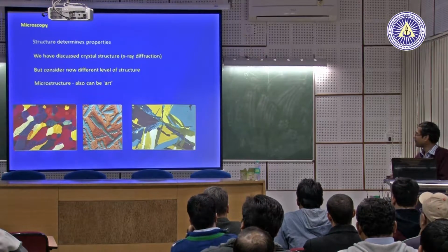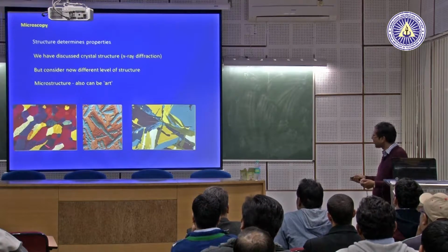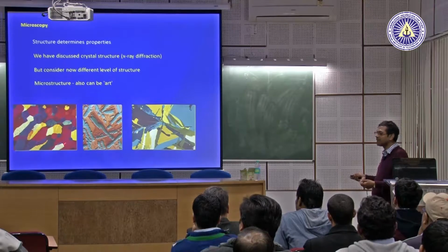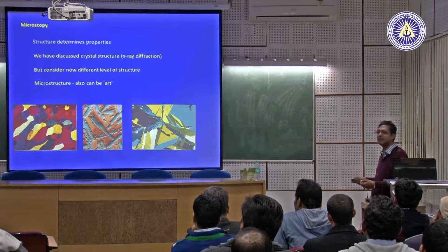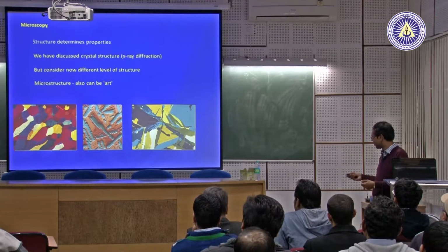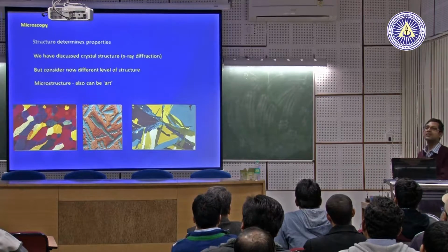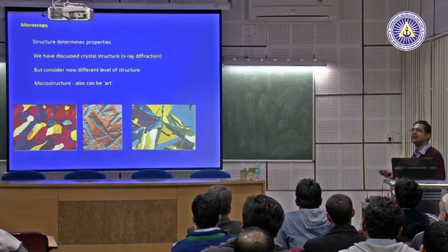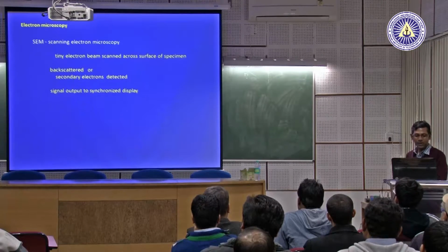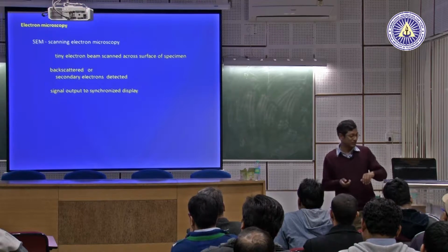That's more important. What we normally make a mistake on in real life is that we can look at it, but we don't understand it. What is inside? What information does it carry? At the end of the course, you must have that idea, so that you go back to your colleges, obtain a microstructure like this, and be able to read it and get information out of it. That is where most people lack understanding. Okay, so I have given you ideas. Now the scanning electron microscope, everybody knows, I have shown the picture.